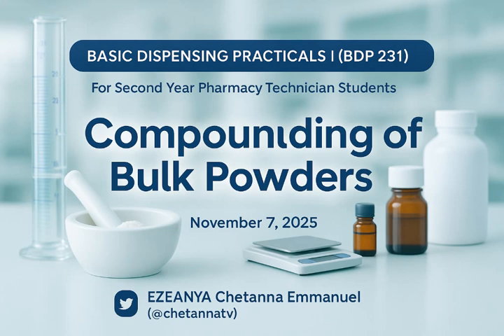Then after that, you draw your label. It depends on the product you want to write the label on. Let's assume it's for dusting powder. Of course, dusting powder is for external use. It's not for internal use. It's an example of bulk powder for external use. So you write here for external use.